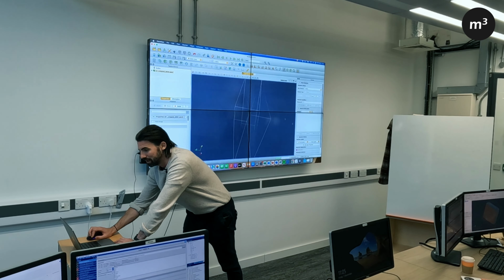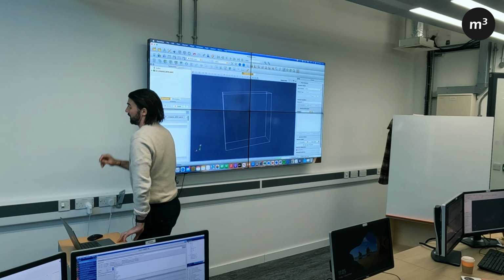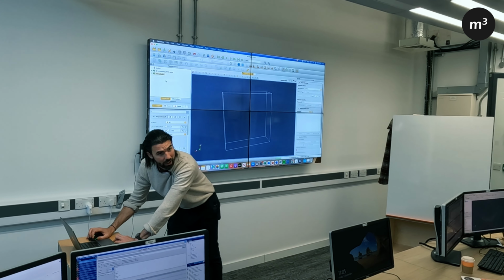If we want to see something, the way I usually do it first is I will click this button here, which is our threshold, which is this letter T inside the 3D dataset. If we click that threshold, it'll bring up a new threshold in the pipeline here.